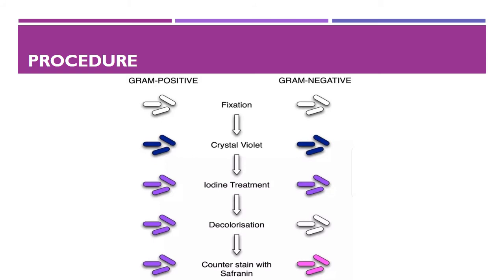Then pour crystal violet dye and keep for about 30 seconds to one minute, and rinse with water. Flood with Gram's iodine for one minute and wash with water. Then wash with 95% alcohol or acetone for about 10 to 20 seconds and rinse with water. Add safranine for about one minute and wash with water.